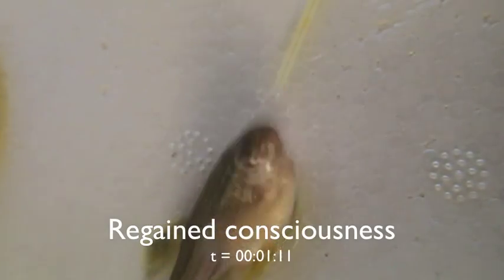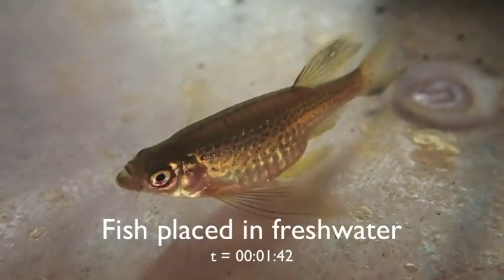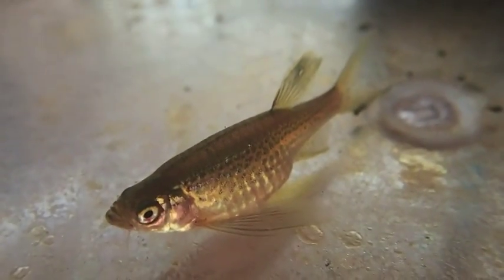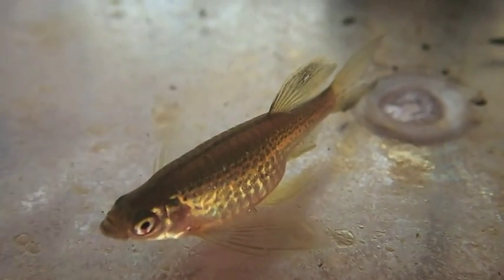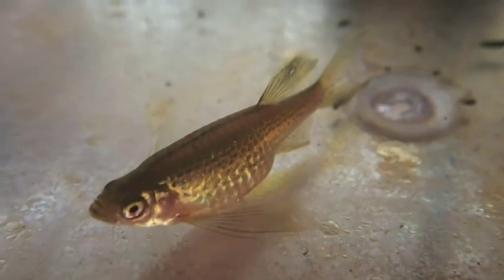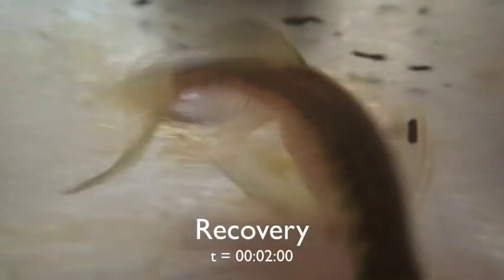Here I've given him a little bit of a prod just to help him wake up a little bit. Once he's ventilating spontaneously on his own, you can put him back into fresh water where he will start swimming very soon. You can see that the eyes are bright and the mouth and gill covers are moving as per normal.